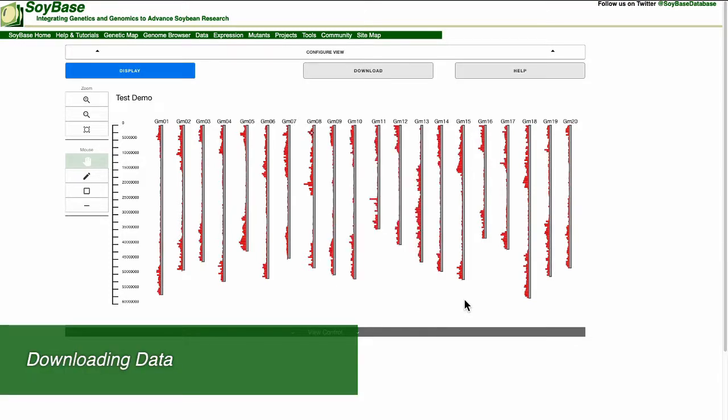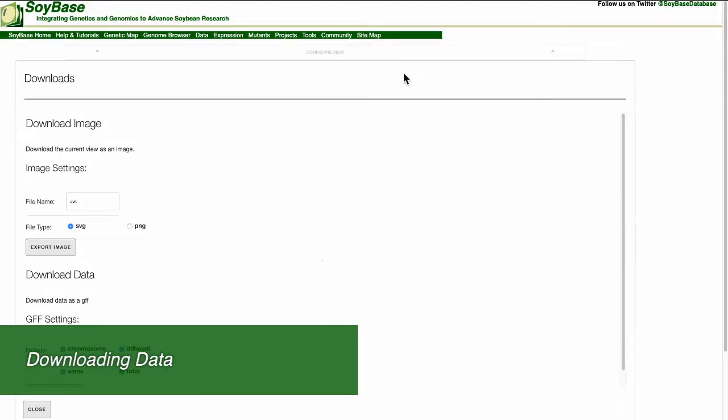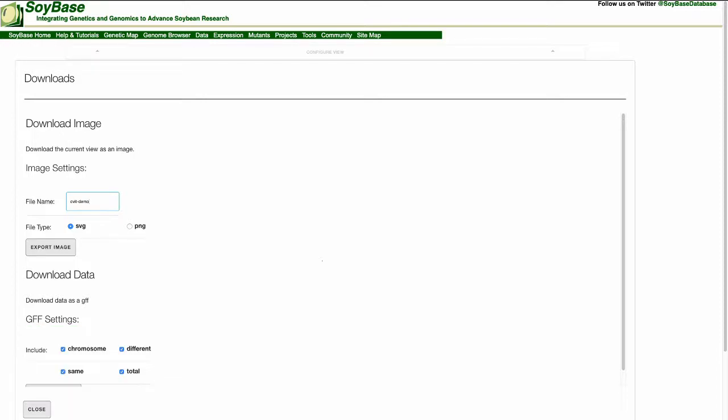And finally, let's download the image. To do this, we will click on the download button. Once we get to the download page, we can download the image as an SVG or a PNG.